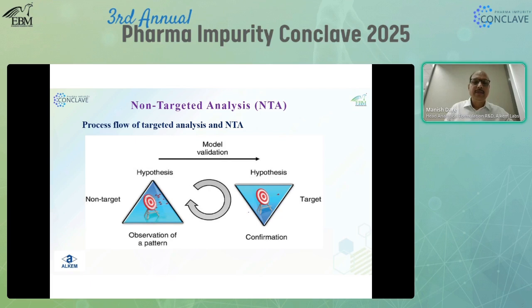Chemical space and analytical approach are what we have to adopt to identify this NTA, and basically NTA is defined in the life cycle management of the product. When developing any method during product development at the R&D stage, we have to have a target for known as well as unknown impurities within the defined limit as per ICH and regulatory body expectations.